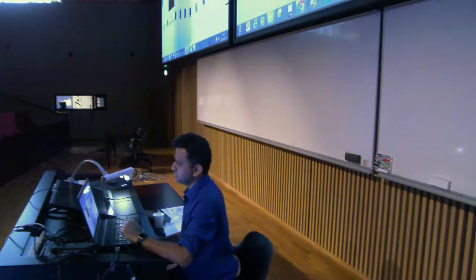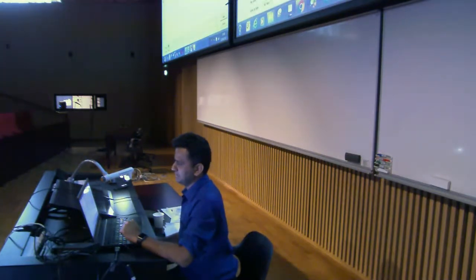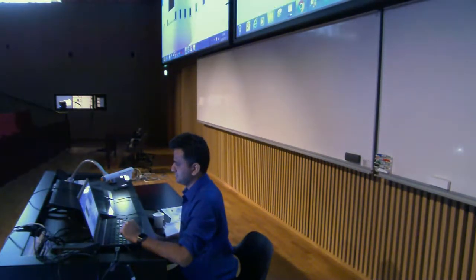It is asking about all time frames? Yes. Before I do this, it's better I make a copy of this so that I don't have to save as TIFF, and I put it on the desktop. Okay, now it's here. So that's good.